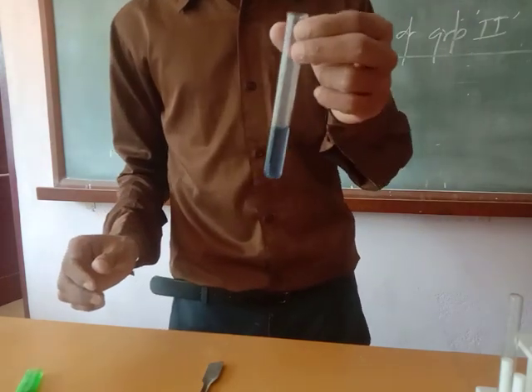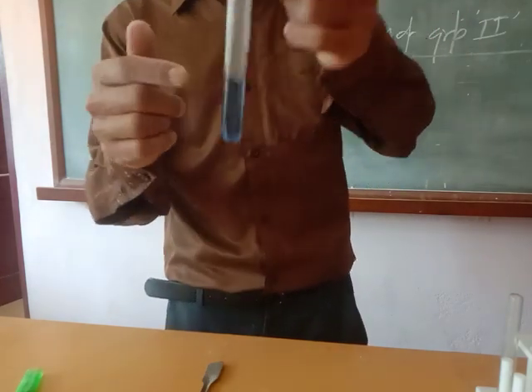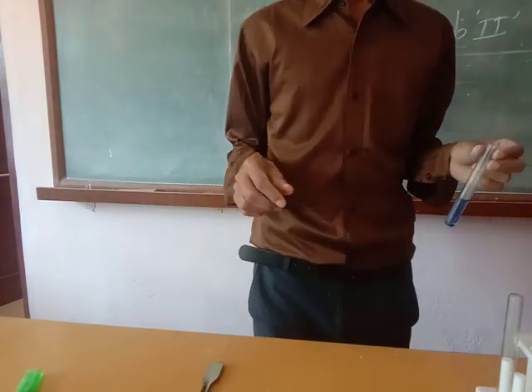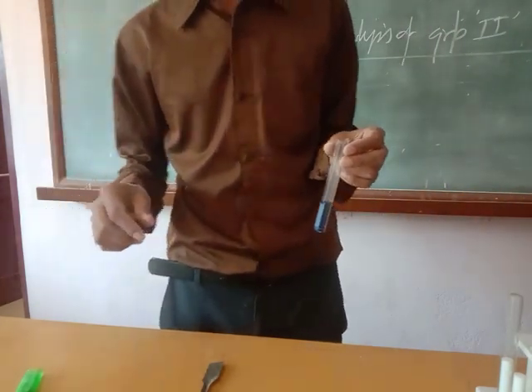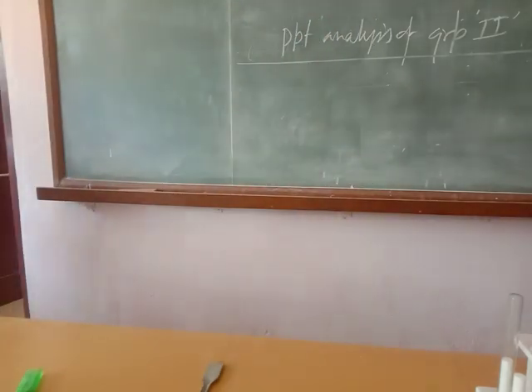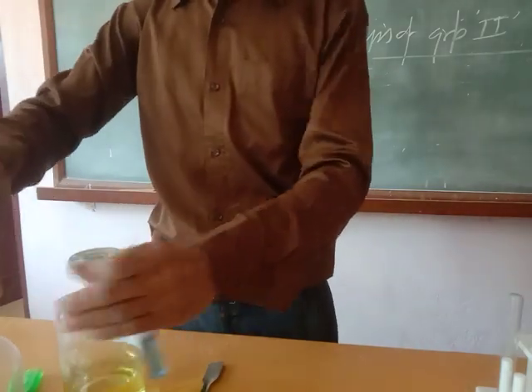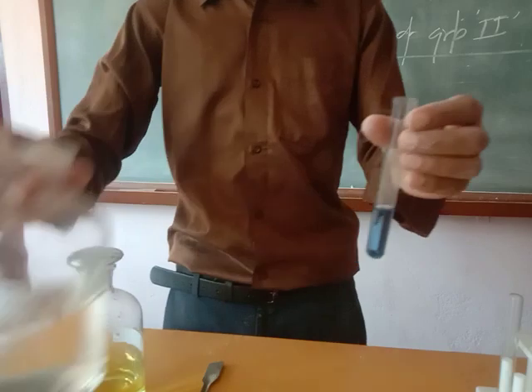To the deep blue colored solution, you add acetic acid and potassium ferrocyanide solution. So this is acetic acid.